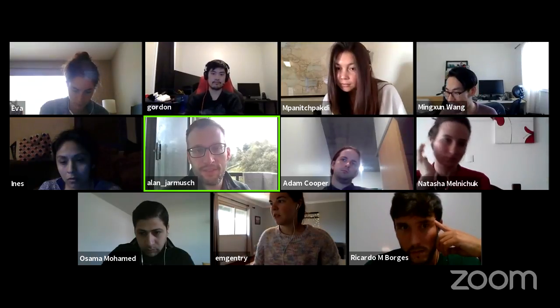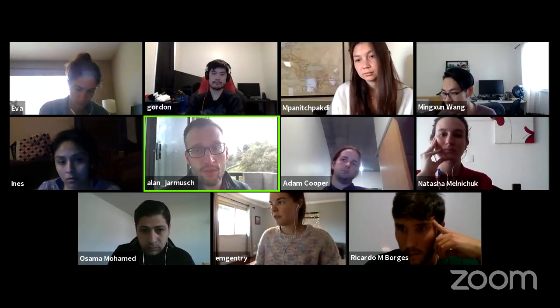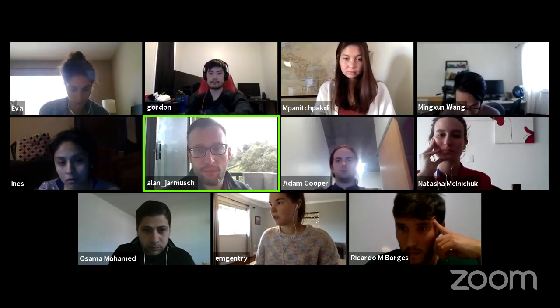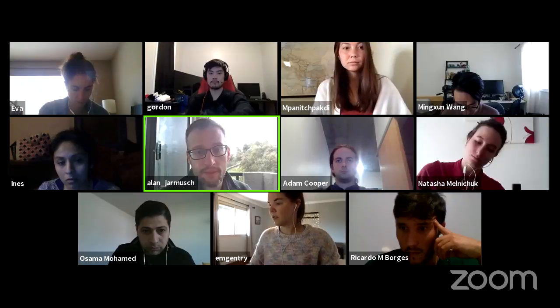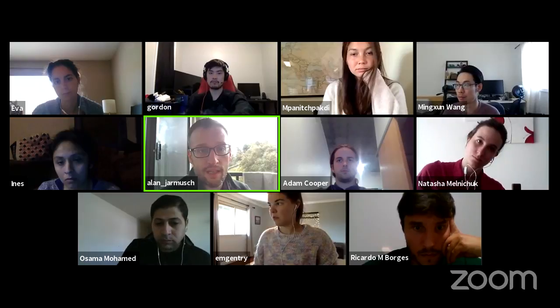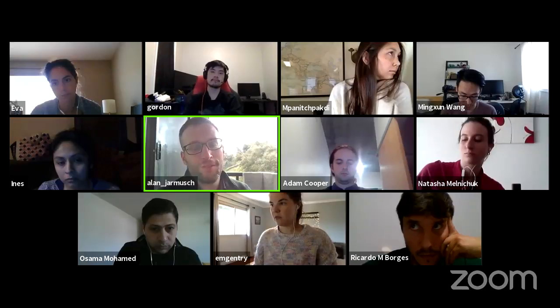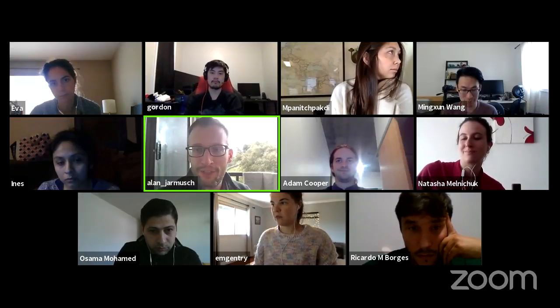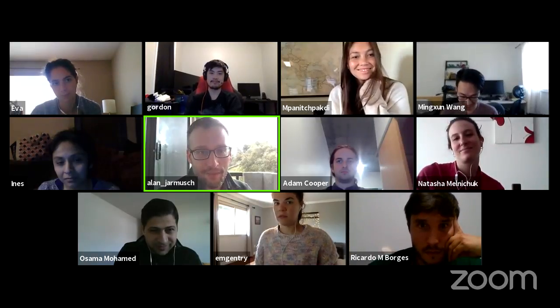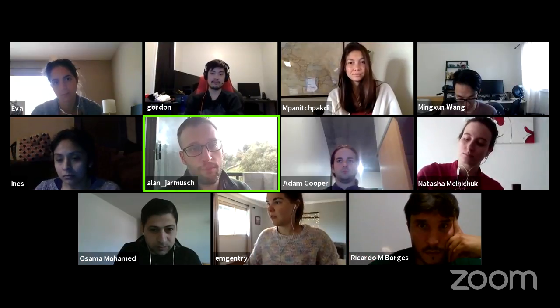Yeah, not to toot our own horn, but that tool has been immensely helpful with preparing manuscripts and presentations, because the quality of the spectra that you get out is consistent. So it looks really good, as well as that USI. I don't want to call it permanent, Minga's gonna yell at me. I know it's not permanent, but it is at least a consistent link, so that if you put it into the resolver online, it will produce the same plot.